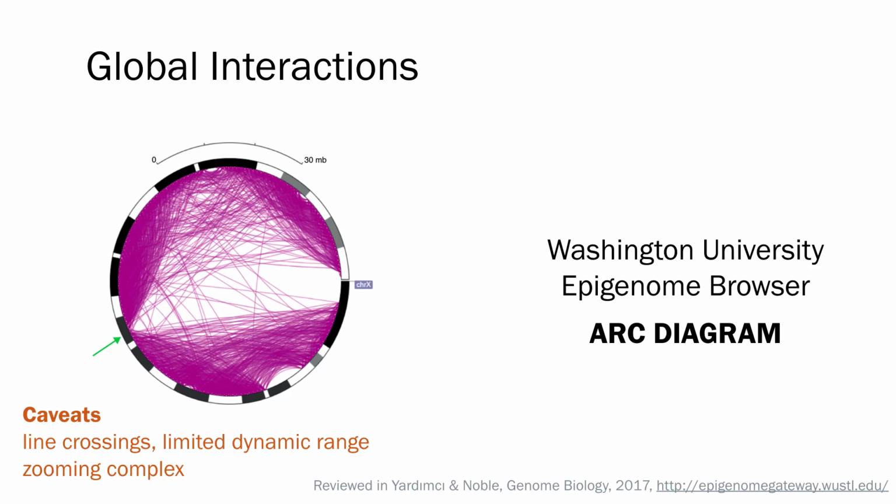So these are interactions within chromosome X, the X chromosome, and obviously the limitations are very obvious here, right? One thing you can see is there are not a lot of interactions between this position and this thing over here. There are a lot of interactions otherwise between multiple loci, but you can't tell really what's interacting with what because these bands are just overplotted so strongly.